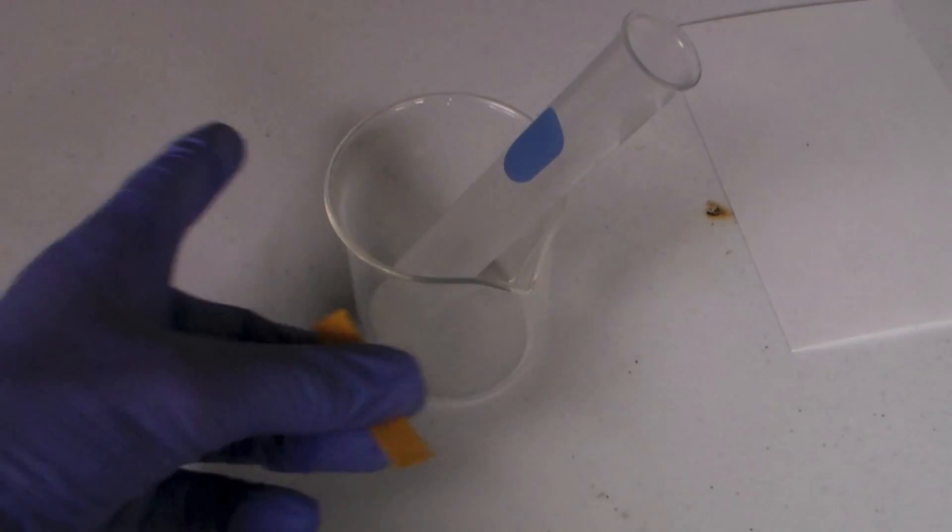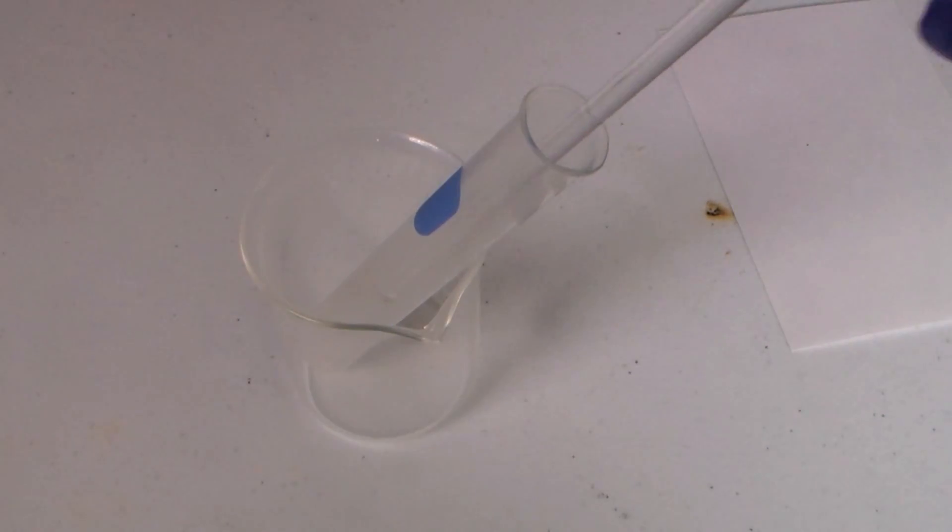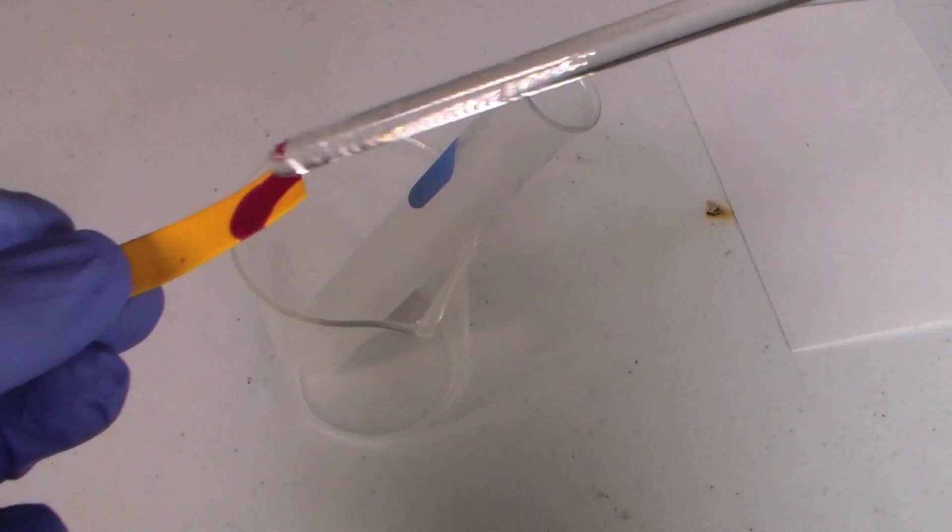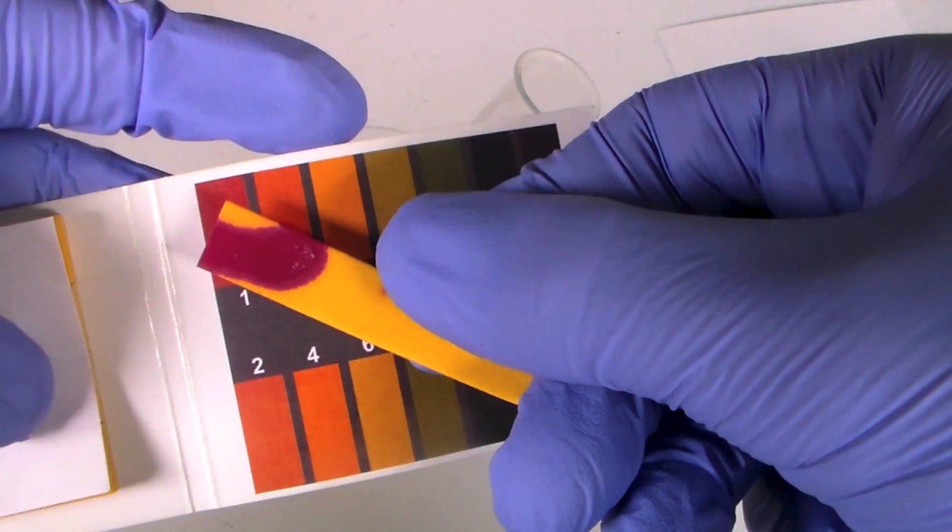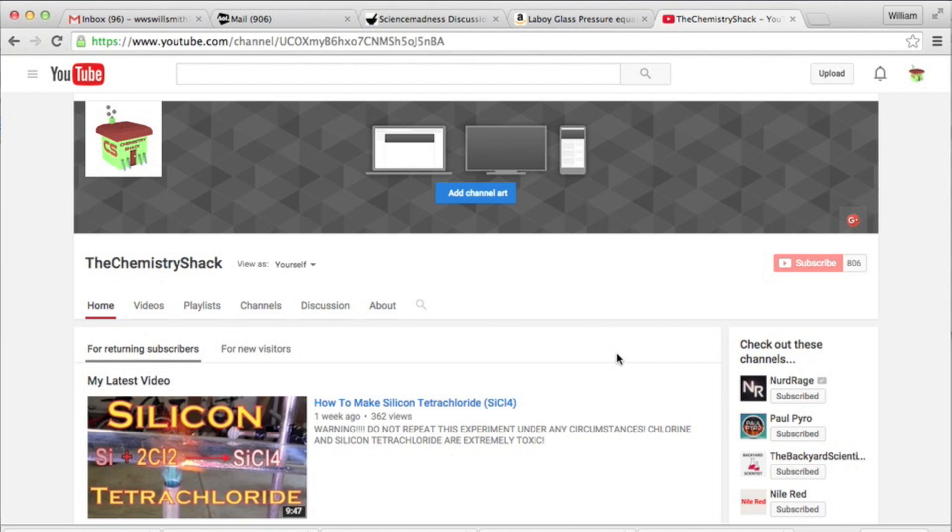We can show that hydrochloric acid is produced by testing the pH of the solution. As you can see, the solution turns the litmus paper red which means it's acidic. Well that's it for this video.